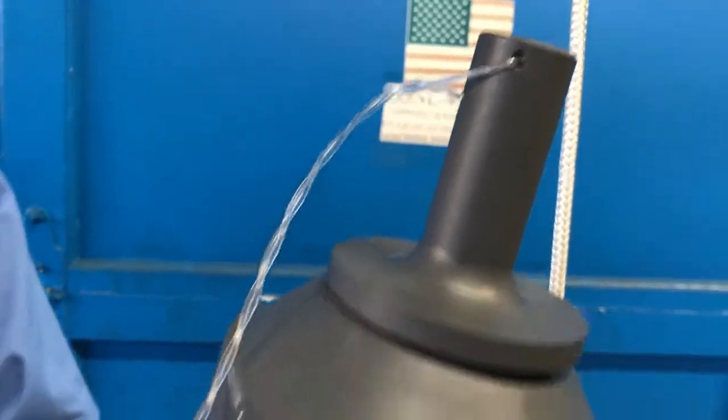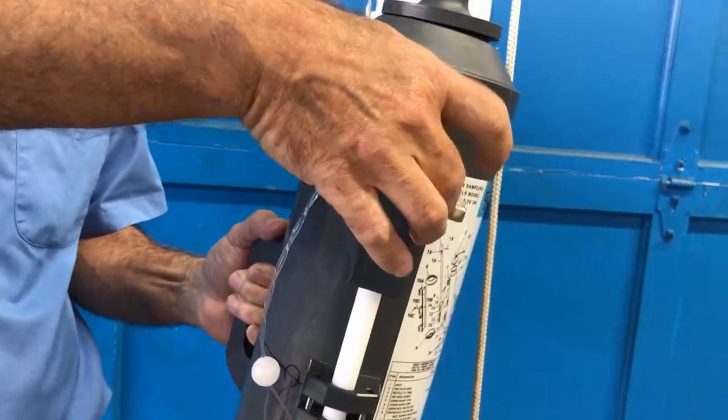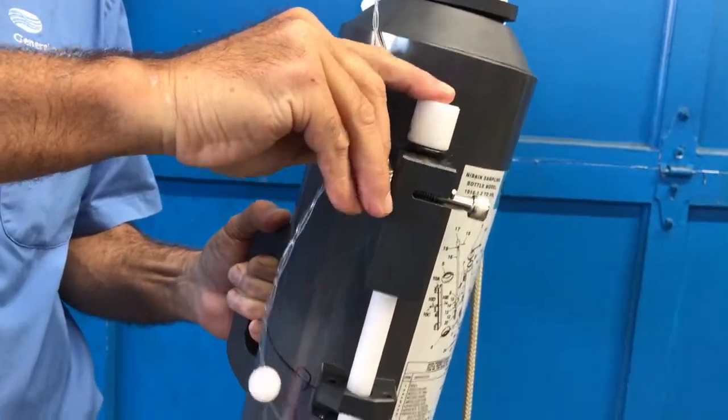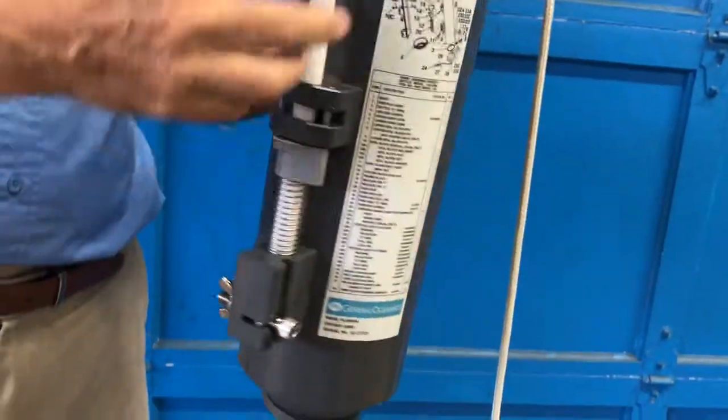The side of the bottle has a spring-loaded pushrod held in place by PVC mounting blocks. The upper and lower mounting blocks are equipped with wire clamp bolts and wing nuts.